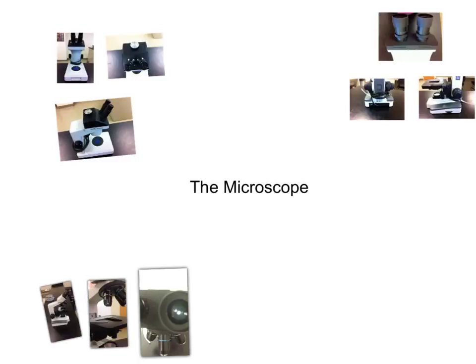The first is going to be the Dissecting Scope, and the second is going to be a Compound Microscope. So let's go and take a look at the Dissecting Scope first.